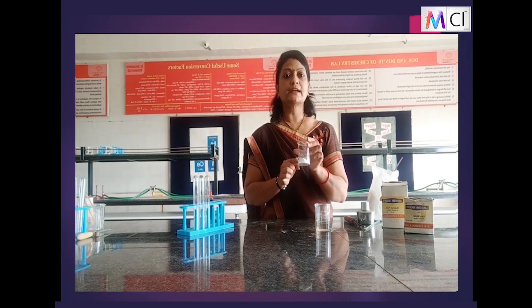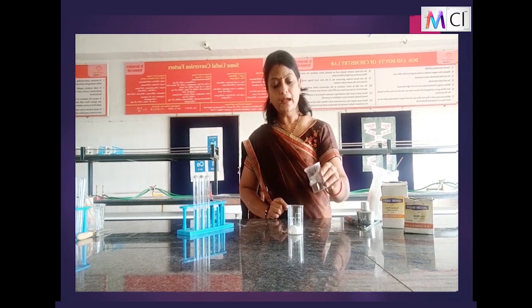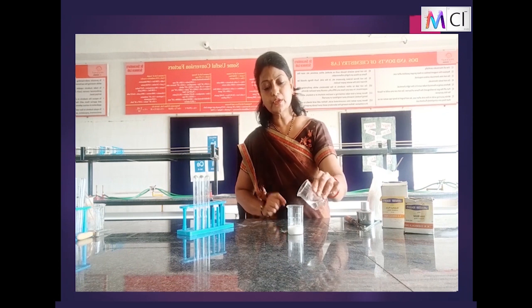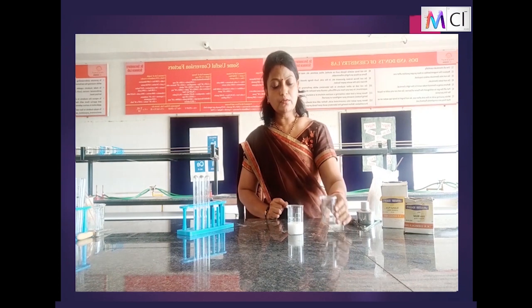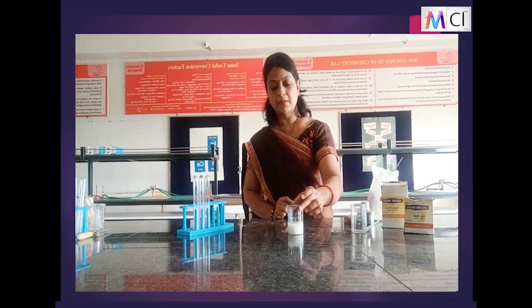That calcium oxide I am taking, to this I will add water. I have taken distilled water, and slowly I go on adding. You can see the fumes, children. It is a highly exothermic reaction. You can hear the crackling sound. Bubbles are there.